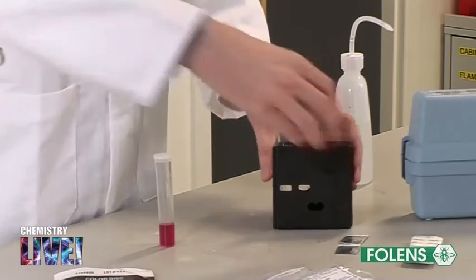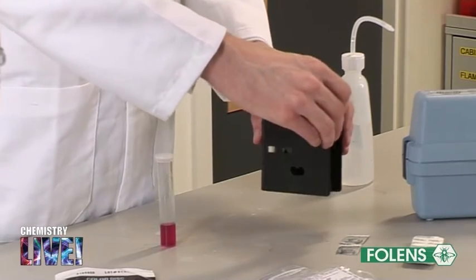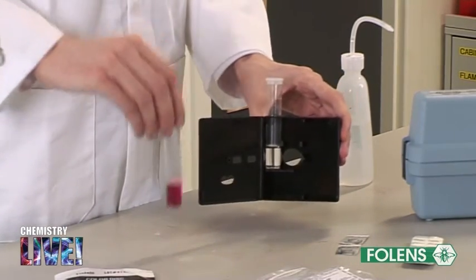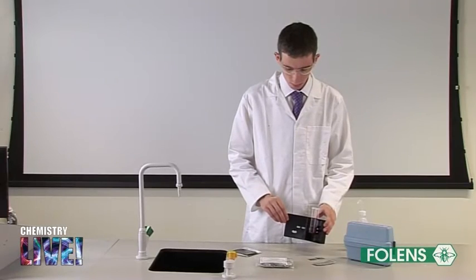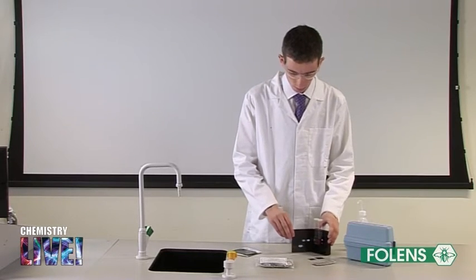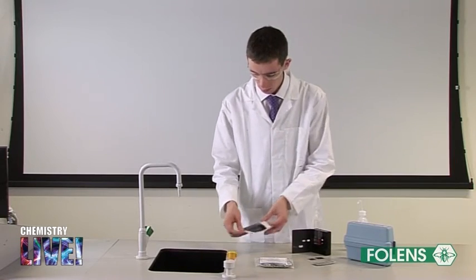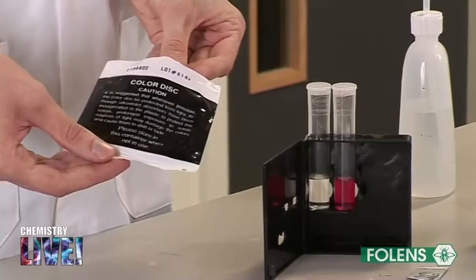Place the second sample tube in the right top opening of the comparator box. Remove the colour disc from its plastic protection cover and place it in the comparator box as shown.